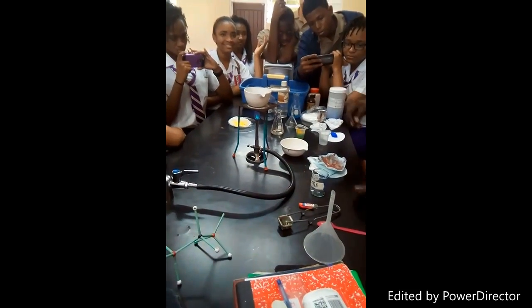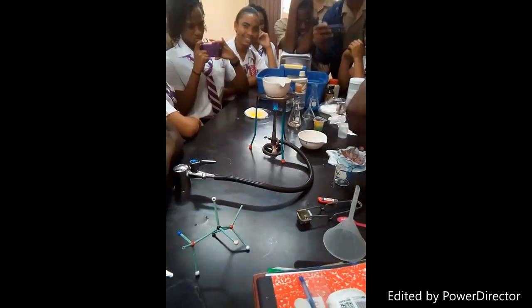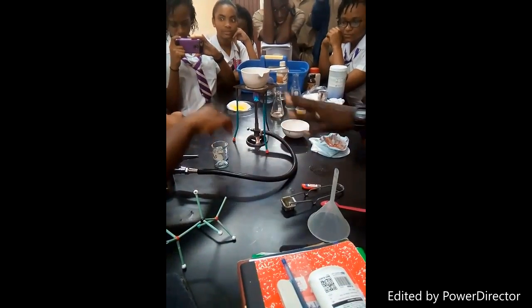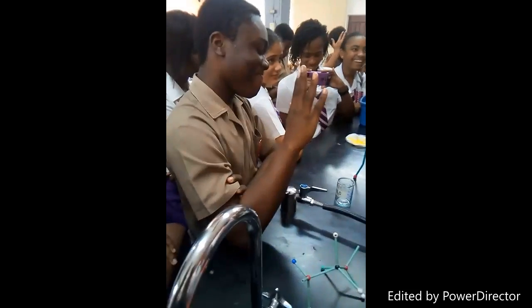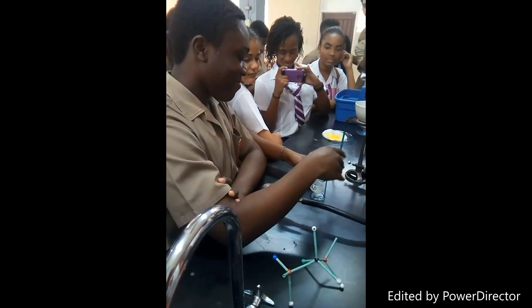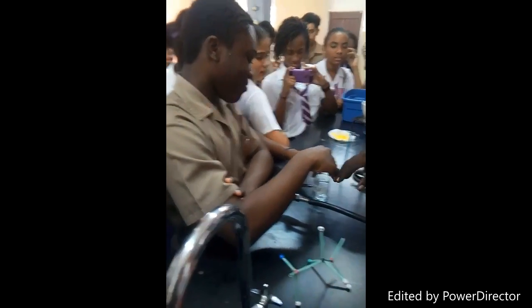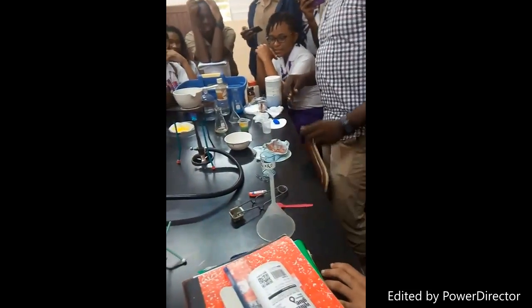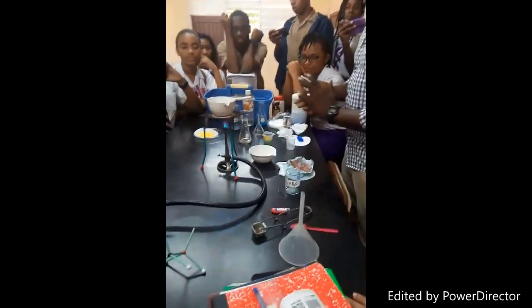Cook, cook, cook. The top of the beaker, you see this part, is not hot. You can touch it. Feel the side now, gently. You recognize that the side is hotter than that part. So if you're holding it, you hold it by up here. Okay? Don't take any chances.